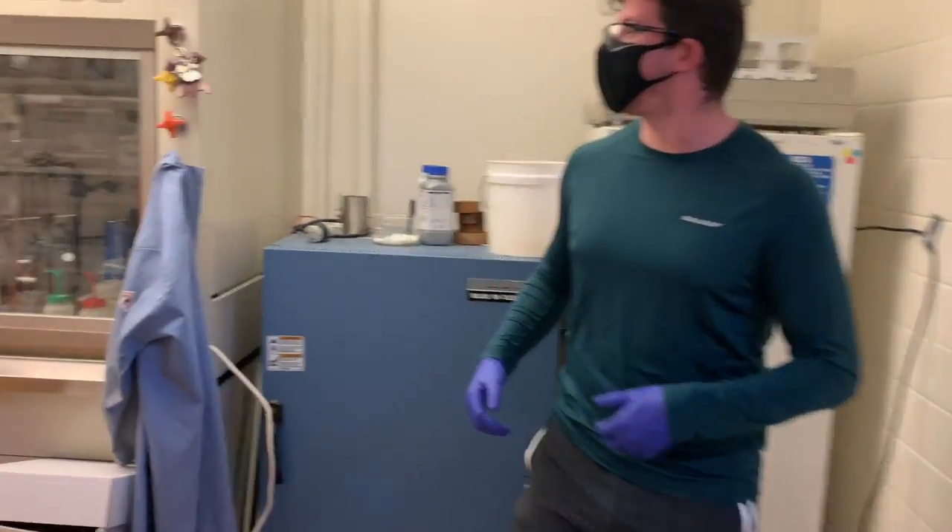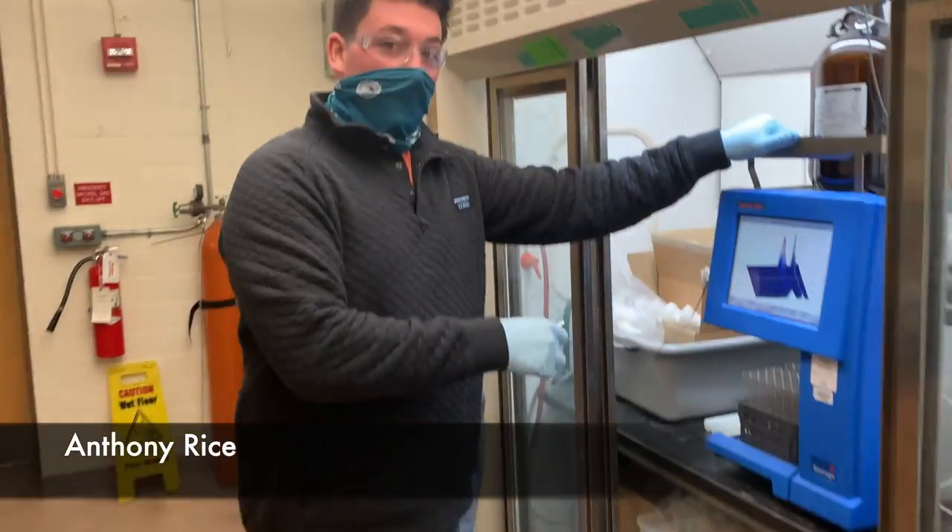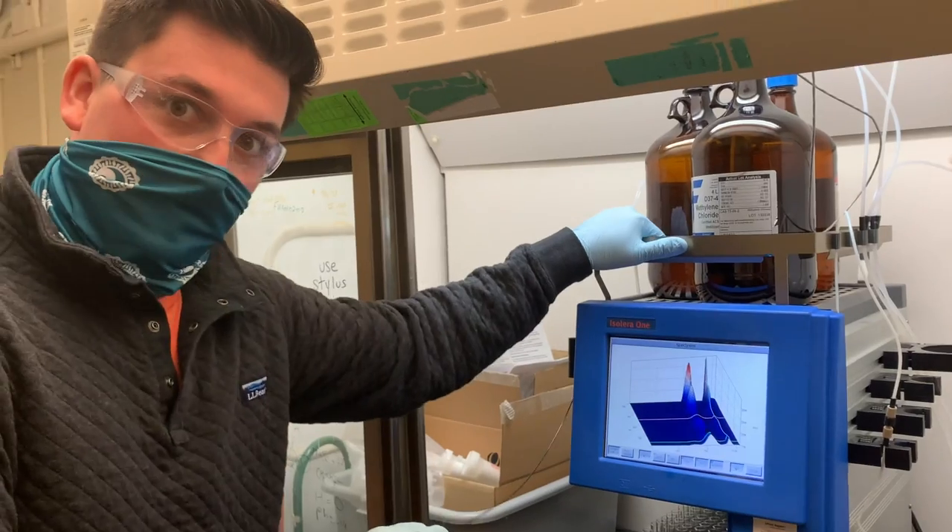Hey Anthony, whatcha doing down there? Hello, I'm using our Biotage automated chromatography unit in order to purify one of our bilidine samples.